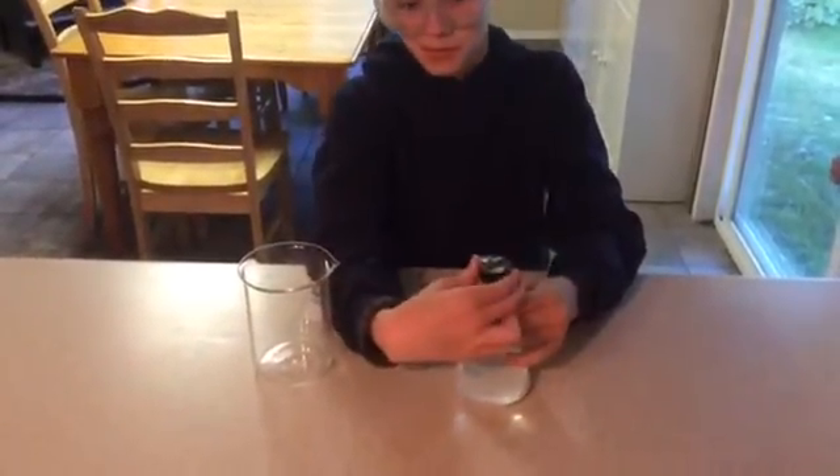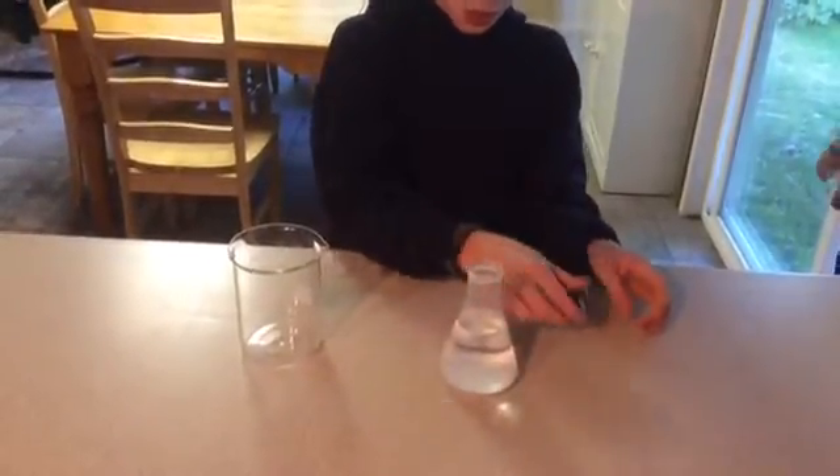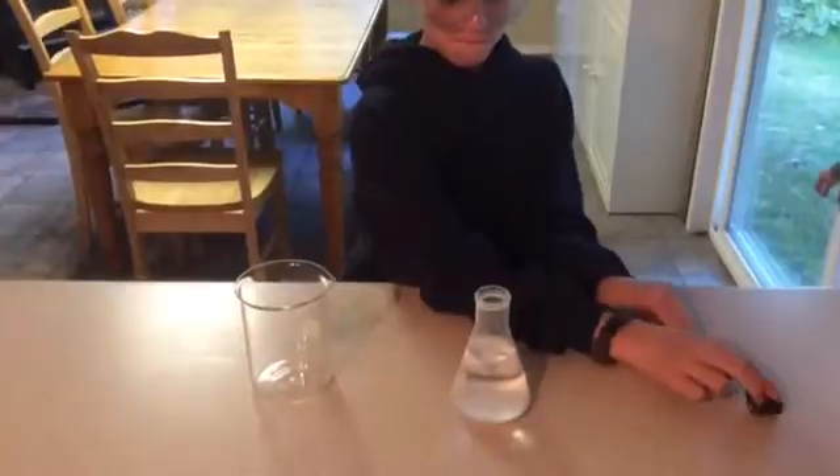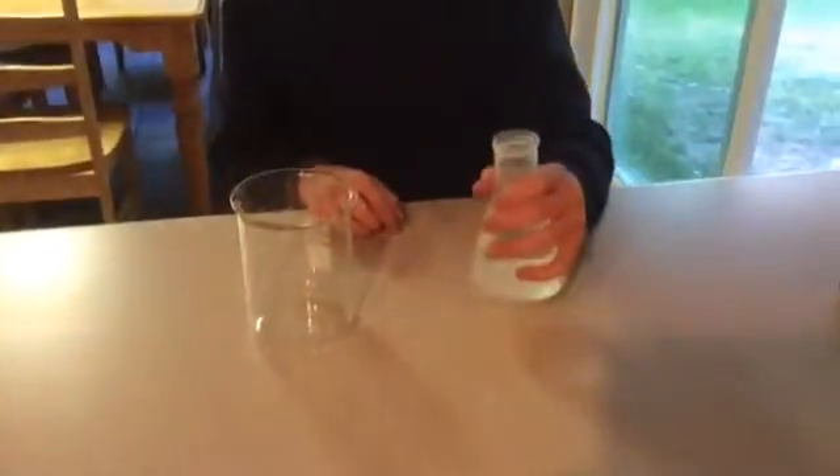So Isaac is taking the stopper off the flask and he has a liquid there that is clear at the top. We've allowed it to sit so all of the particles have settled to the bottom of the flask.